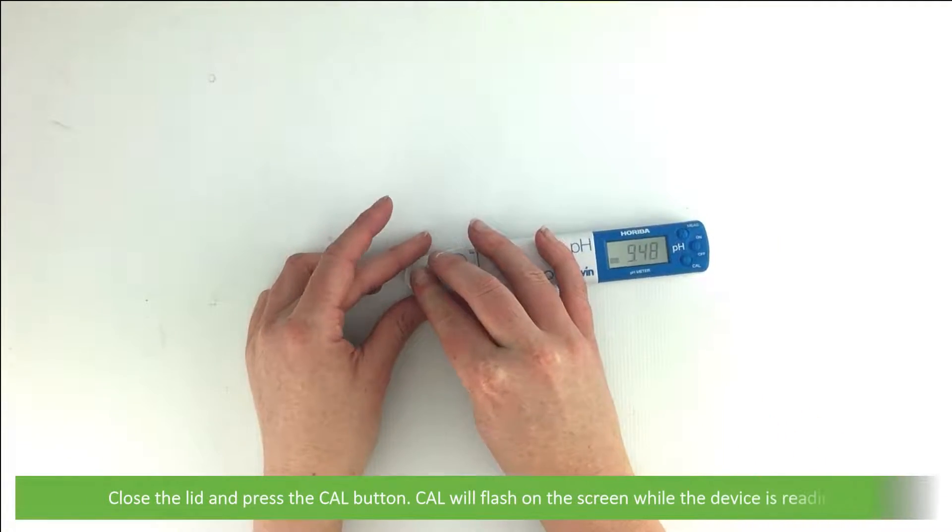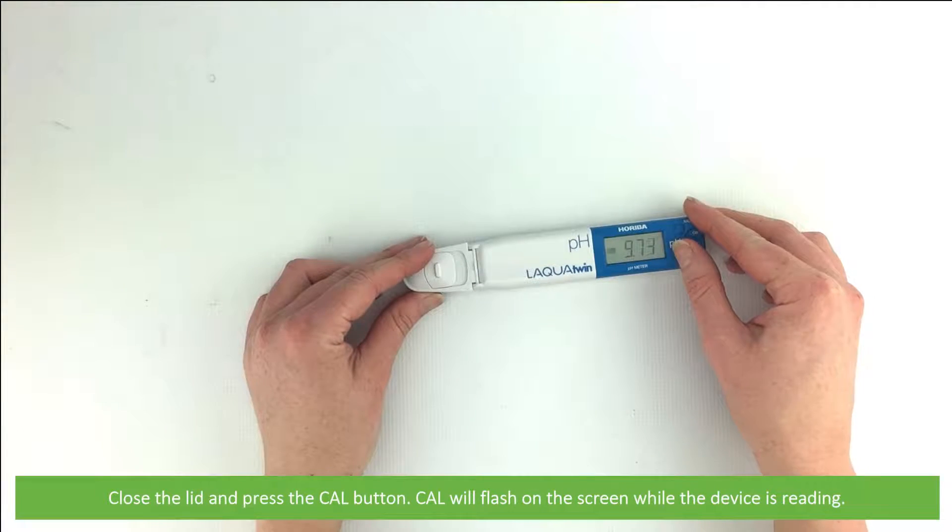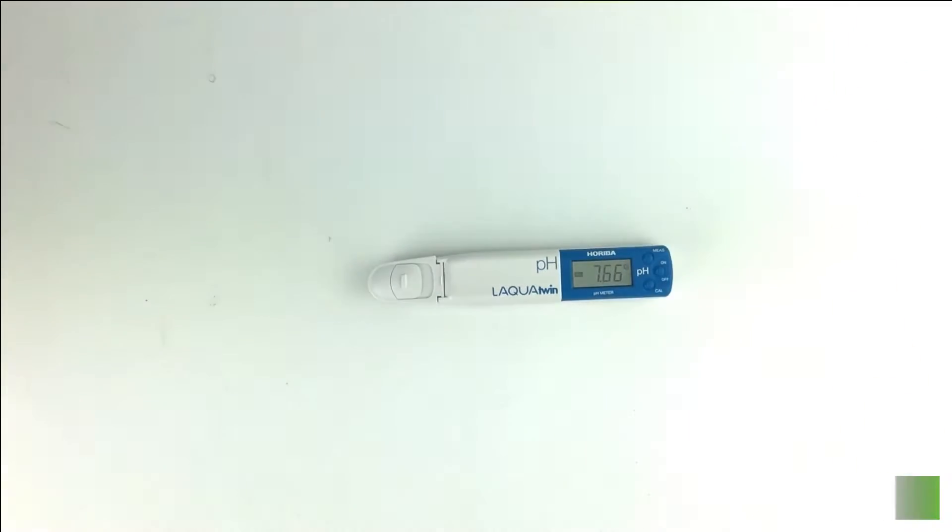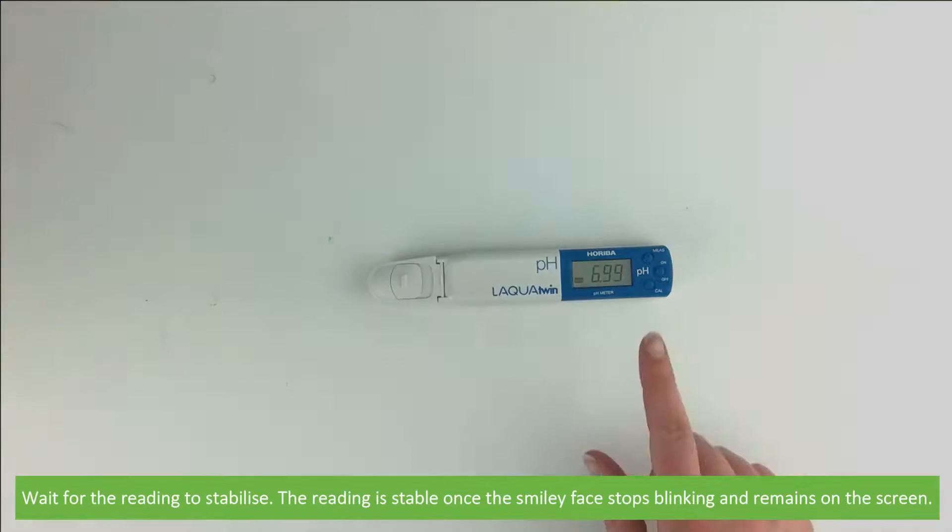Close the lid and press the Cal button. Cal will flash on the screen whilst the device is reading. Wait for the reading to stabilize. The reading is stable once the smiley face stops blinking and remains on the screen.